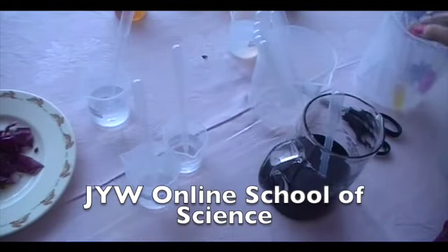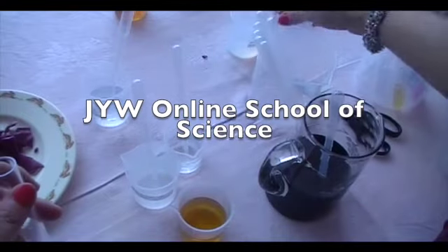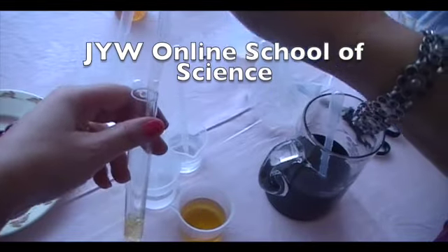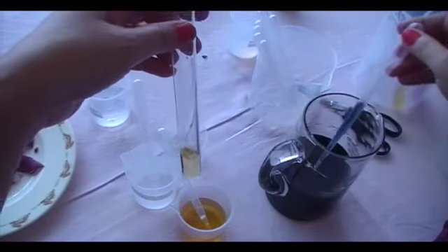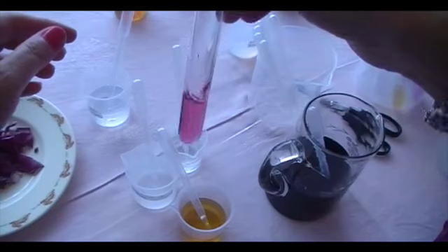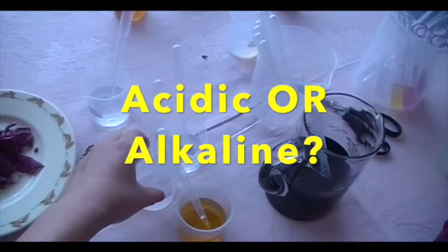Let's try one more. Let's try apple juice. This is apple juice. Apple juice has its own color. So let's see. Apple juice. And it is acidic, so my prediction would be it turns red. See whether that turns red or not. You see? It turned red. So the apple juice, apple is acid. So that's how you test whether anything is acidic or alkaline.